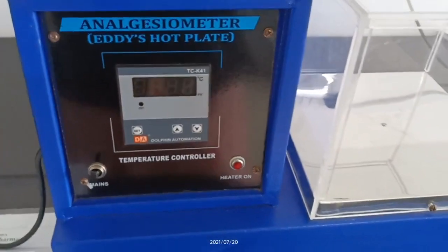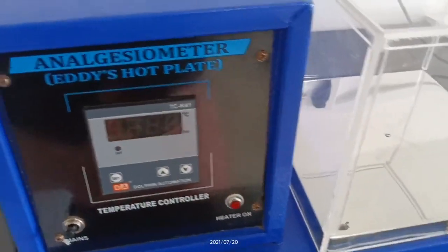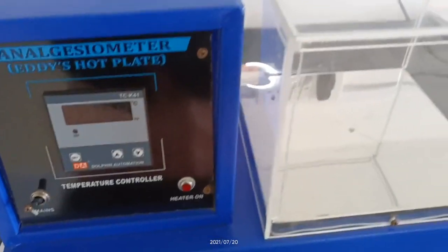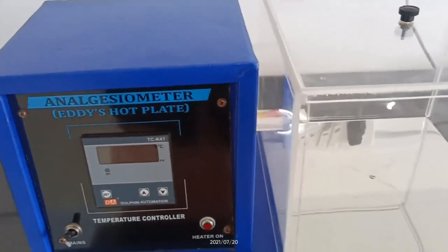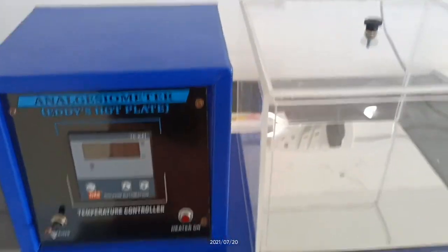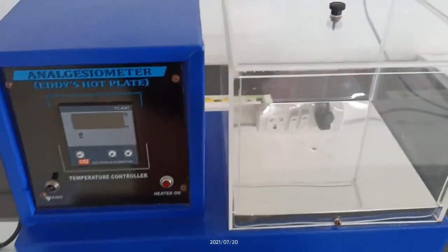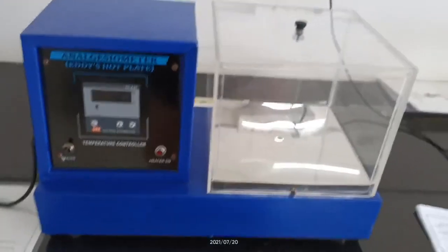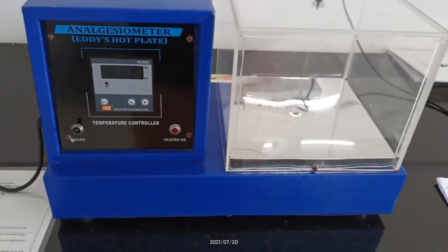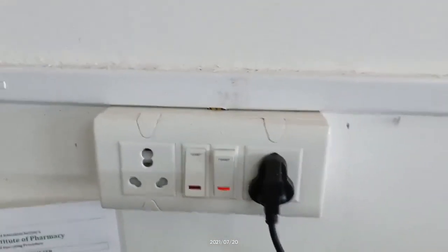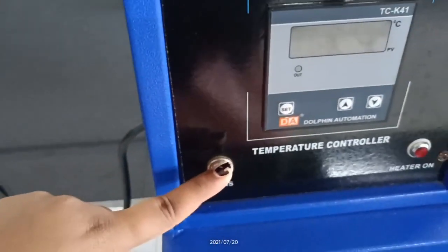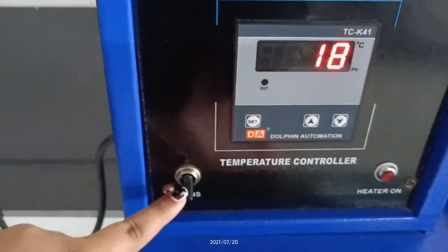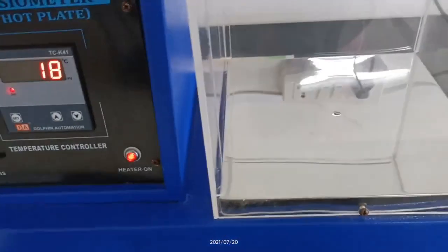I am not going to give you a demo; I am going to explain the procedure of how to check the analgesic drug effect using the ED's hot plate analgesiometer. First, we have to clean the instrument with a dry, clean cloth. Then we plug in and switch on. We turn on the on/off switch, and the instrument starts — heating also starts.